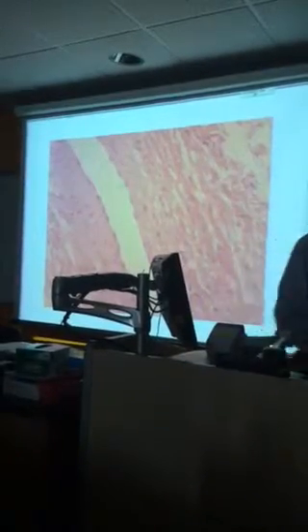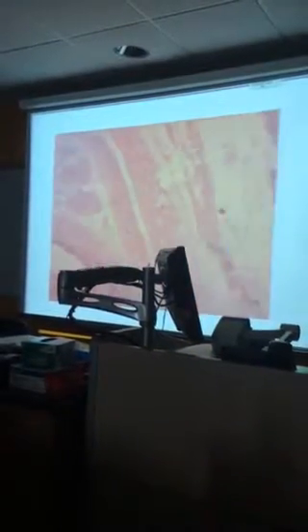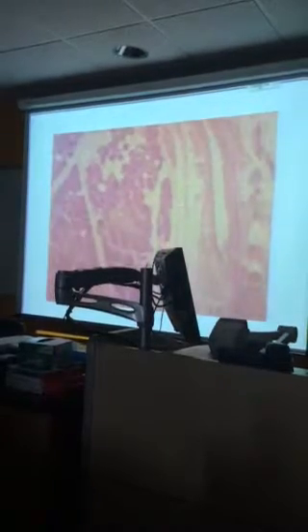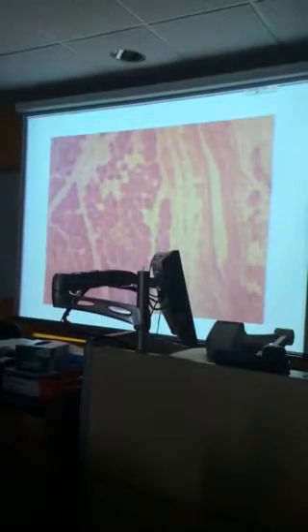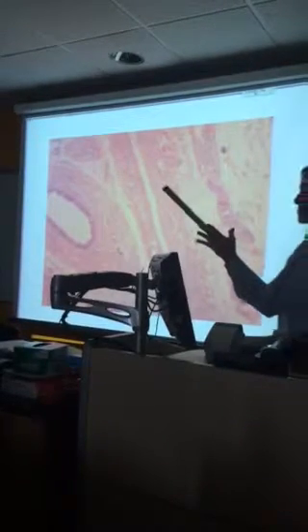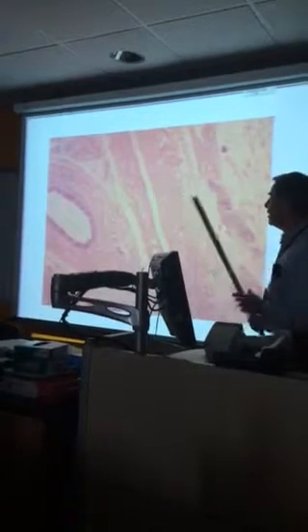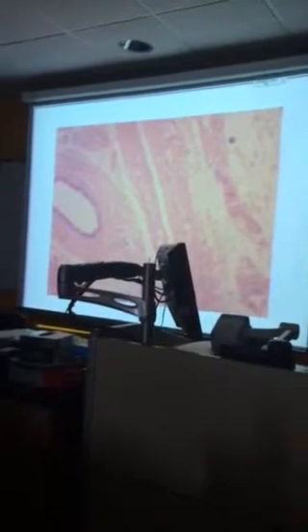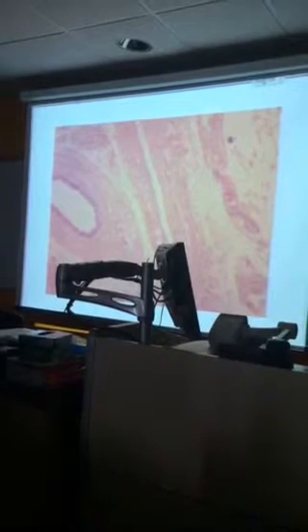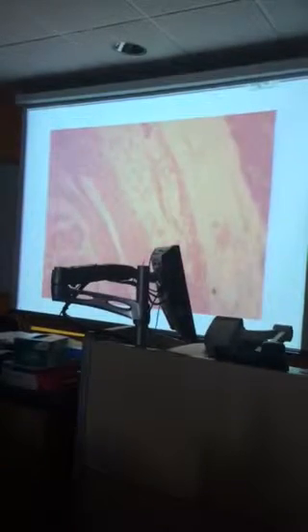Okay? And if you look at the size of this thing and the shape, would you say this is an artery or a vein? Yes, it is a vein. Why? Because it's quite large. It's pretty much collapsed. No blood is in it. It's got a relatively thin wall. An artery basically would be smaller, have a thicker wall, and it would maintain its shape. It'd probably be more round or oval. But veins are highly variable. You can see that's the vein.